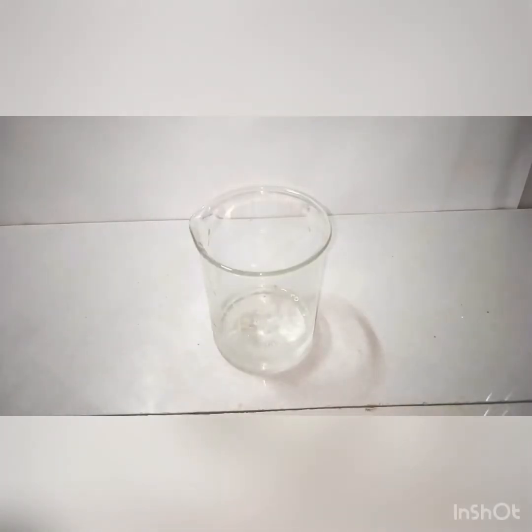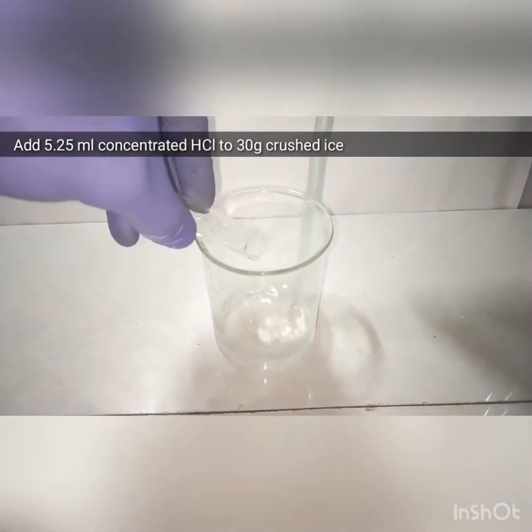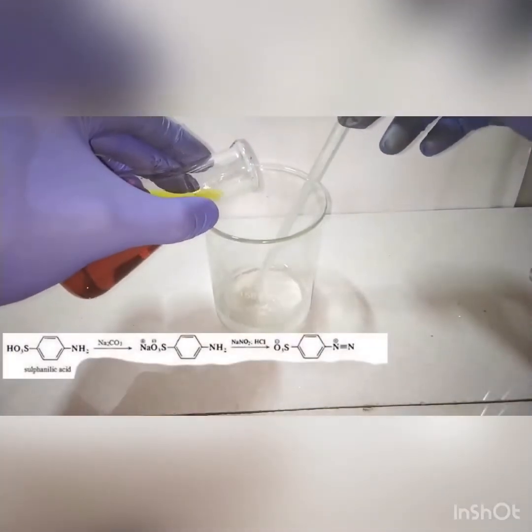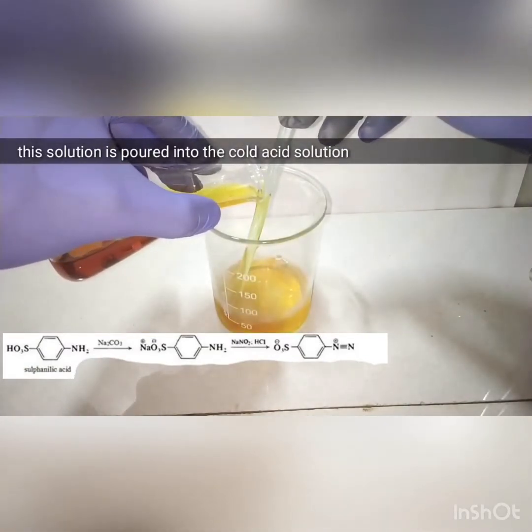Now we are making another solution by adding 5.25 ml of concentrated hydrochloric acid into 30 grams of crushed ice. After cooling, we add the previously made solution into this cold acid solution.